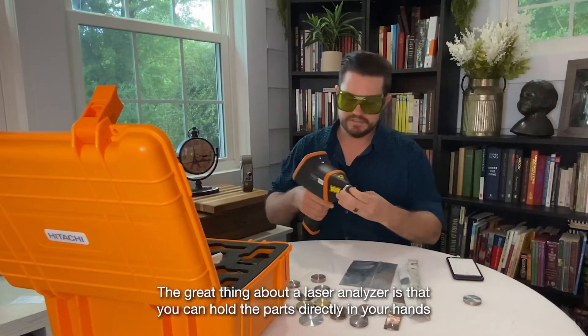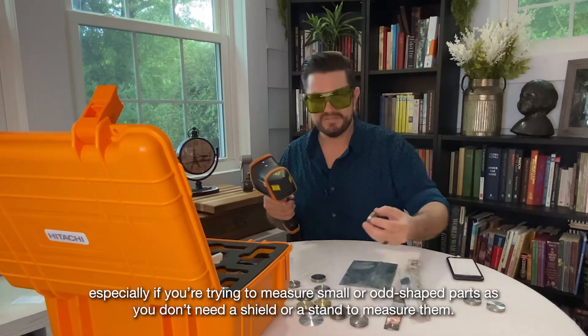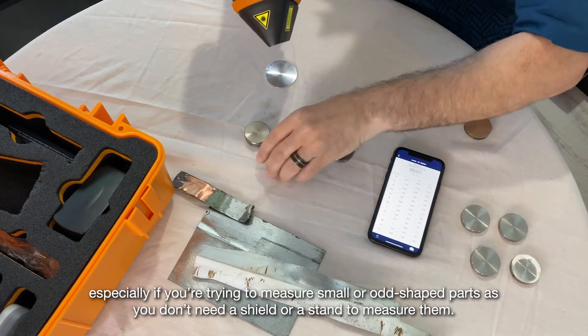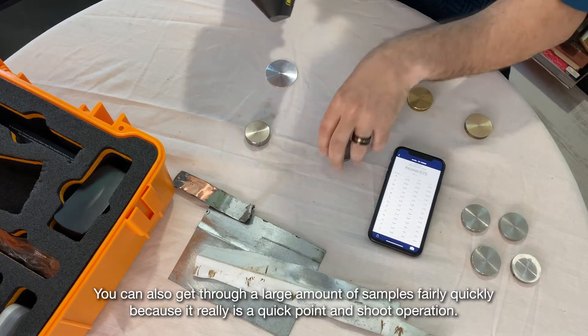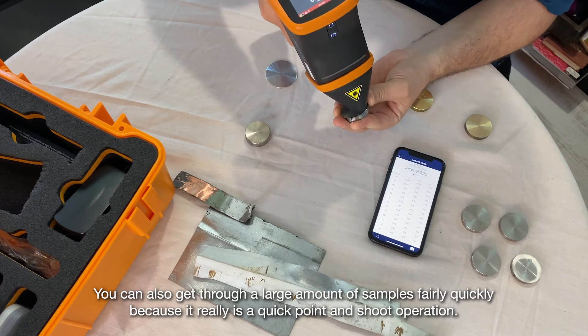The great thing about a laser analyzer is that you can hold the parts directly in your hands, especially if you're trying to measure small or odd-shaped parts, as you don't need a shield or a stand to measure them. You can also get through a large amount of samples fairly quickly because it really is a quick point-and-shoot operation.